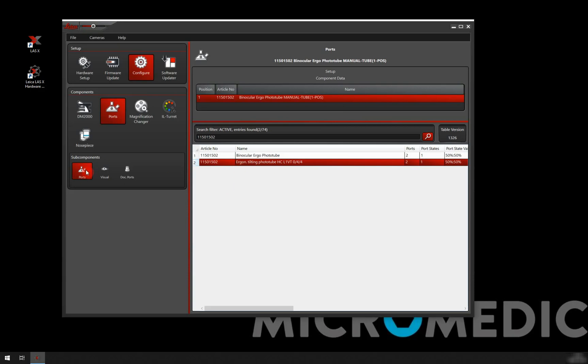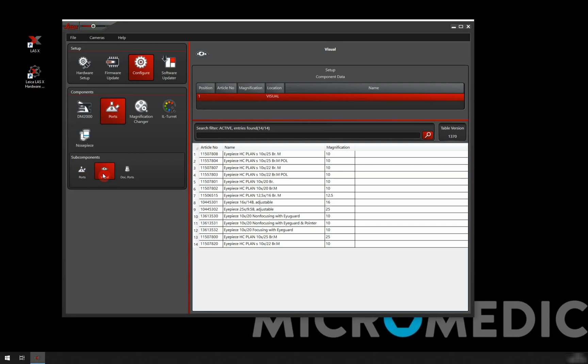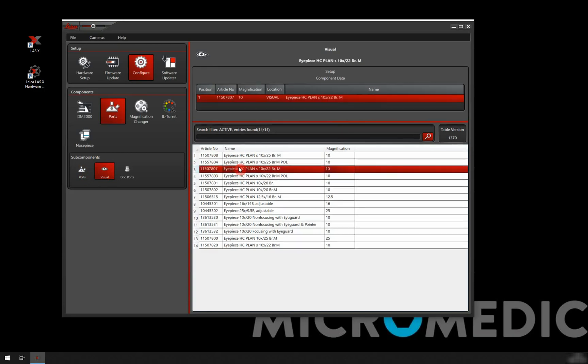We have some sub components on the ports. We have our visual. This is our eyepieces. So again, we go through. This is not a very long list, so you can probably find your eyepiece quite quickly. I have these ones. I will just double click on this and we have them pop up here.